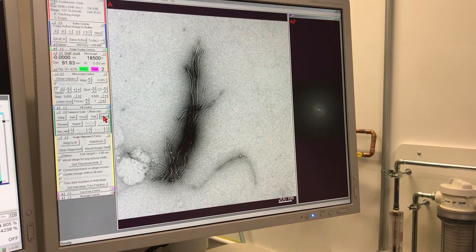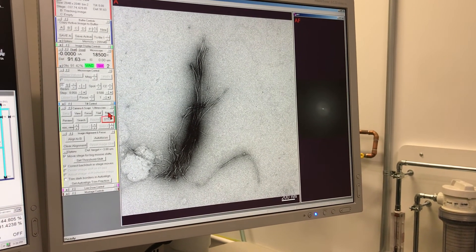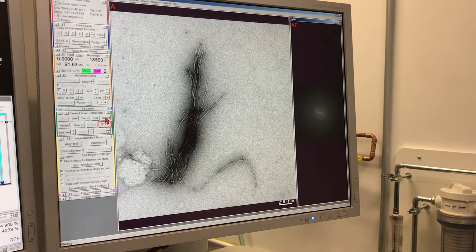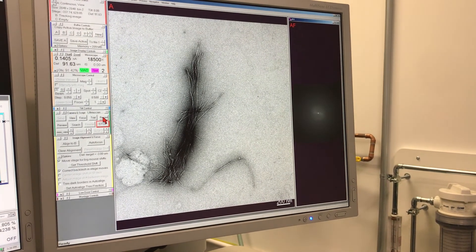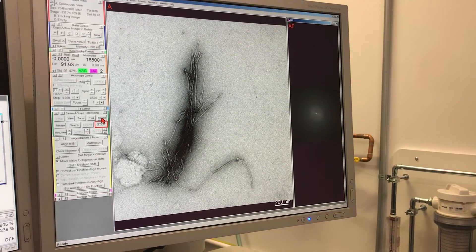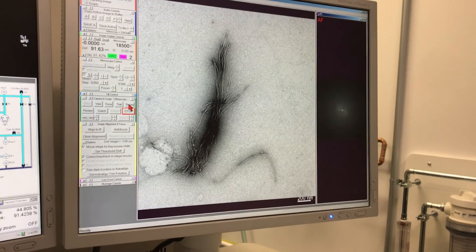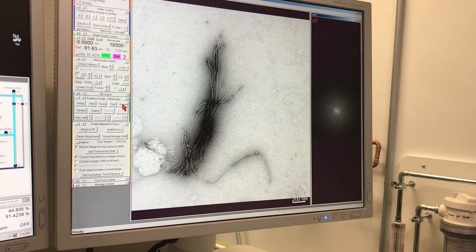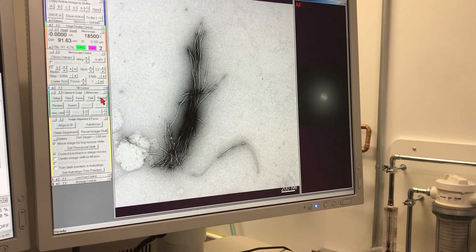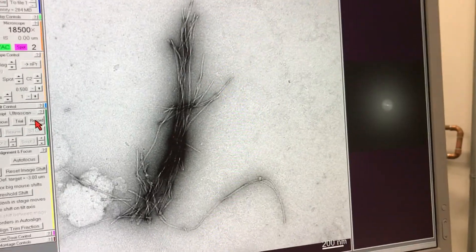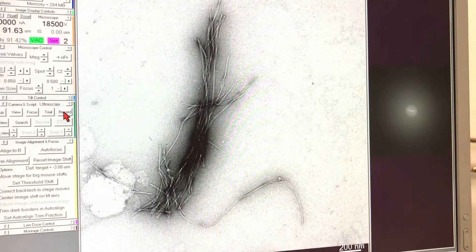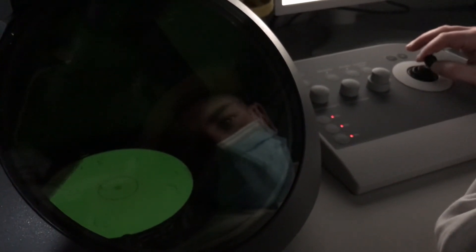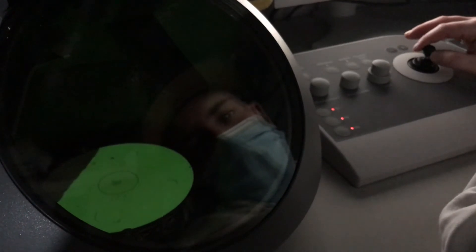The other reason that the image we saw was blurry is because it doesn't have the right defocus, so we're not getting any kind of right information in terms of the spatial frequencies from this image. At a very long defocus, we're going to an area where we can find a protein with the help of the joystick on the control panel, and we can take a view image.